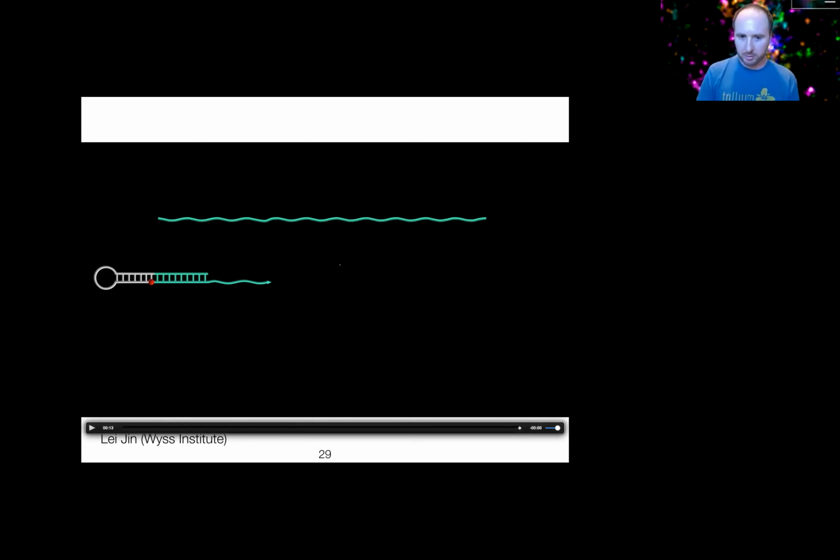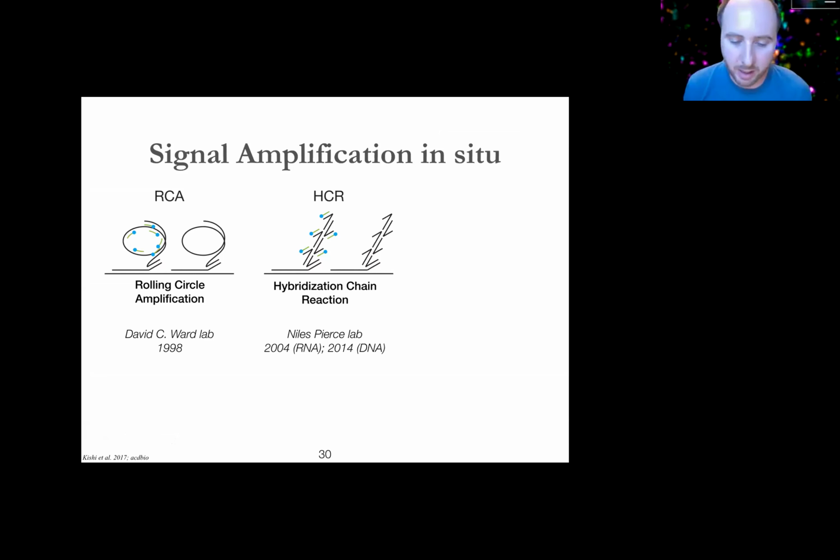Great. Okay, so how this connects back to the omics world is that we're looking at this PER reaction as Josie was finishing this development and thinking about the kind of things it might be useful for in a general sense, not even necessarily just in the cellular context. And it became very clear looking at it that we had something on our hands that looked very similar molecularly to some of the other technologies that are being used very actively to amplify signals in cells and tissues, like the RCA technique from David Ward's lab and the HCR technique from Niles Pierce's lab.